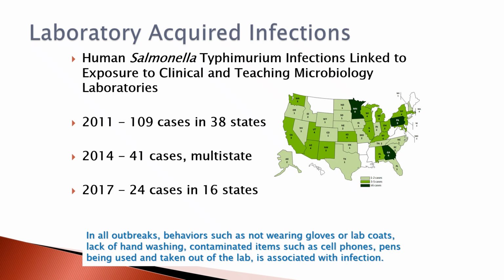In all of these outbreaks, behaviors such as not wearing gloves or lab coats, lack of hand washing, contaminated items such as cell phones, pens, and the like were being used and taken out in lab and associated with infections.